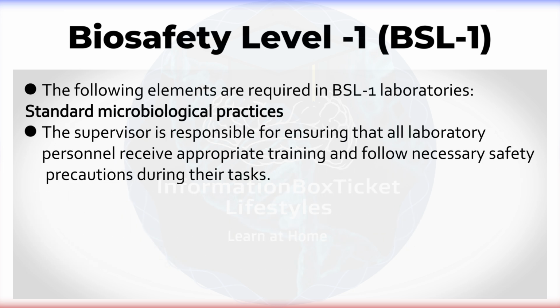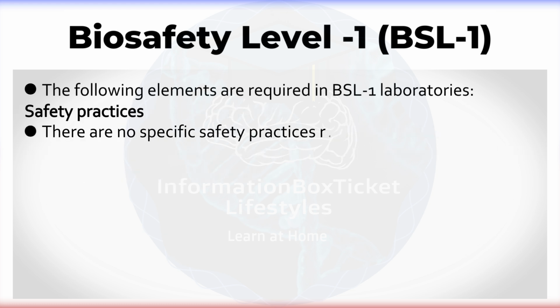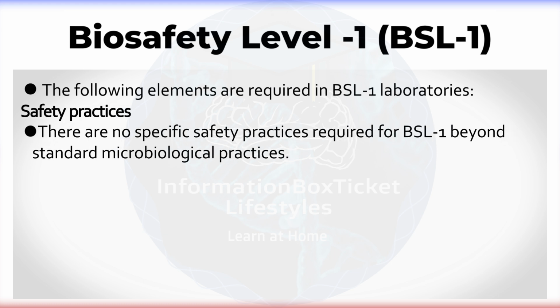The supervisor is responsible for ensuring that all laboratory personnel receive appropriate training and follow necessary safety precautions during their tasks. Safety practices. There are no specific safety practices required for BSL-1 beyond standard microbiological practices.